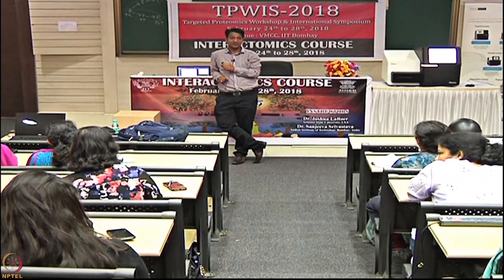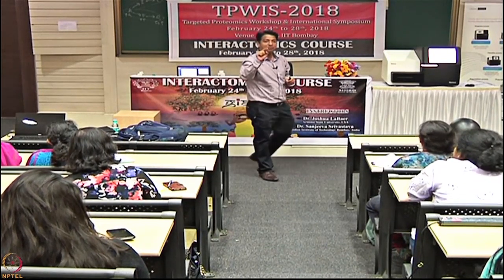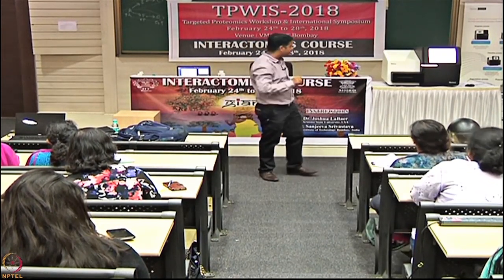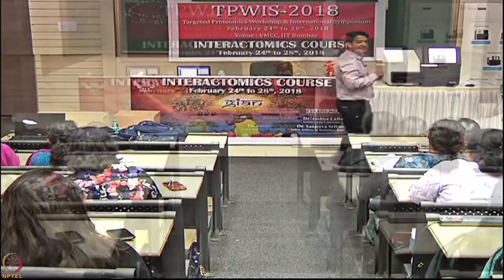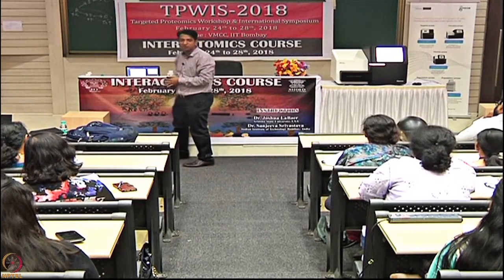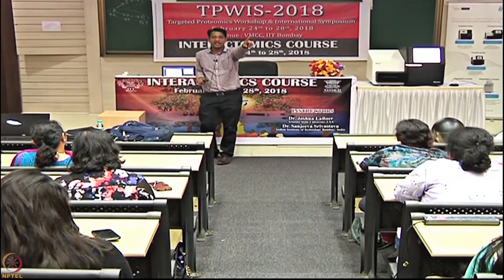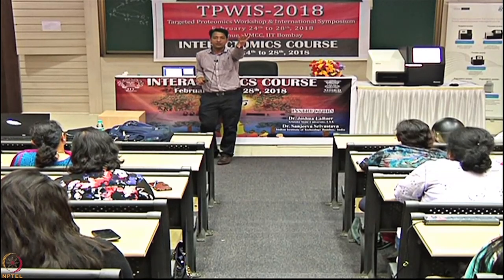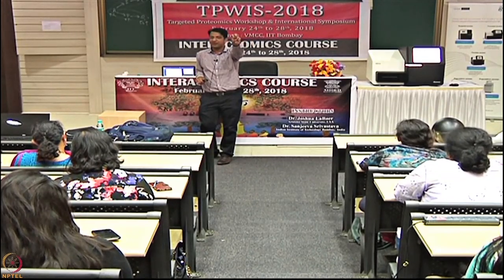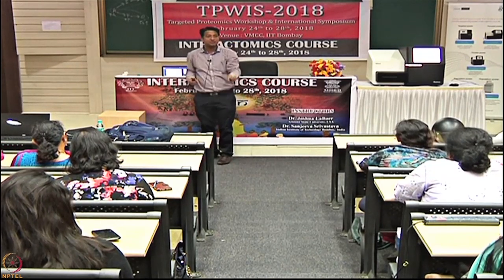3 million. So 3 million Sanger reactions you need to carry out to complete the human genome sequence. And the sequence you will be getting will be covered at 1x coverage. So even if you carry out 3 million reactions, you will be covering your bases how many times? One time. So the coverage will be 1x. So if you wish to sequence a human genome, do you wish to invest 10 years more?